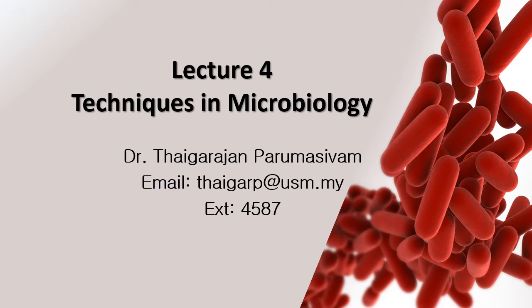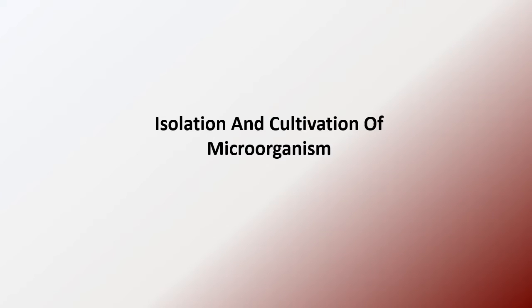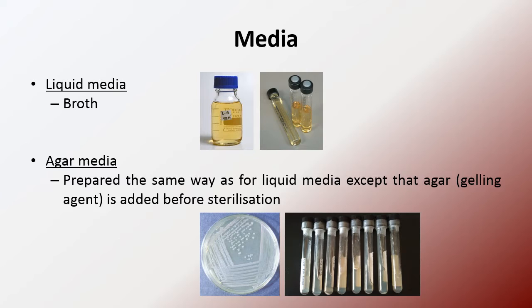Hi everyone, this is the second lecture on the techniques in microbiology. We will learn about isolation and cultivation of microorganisms, particularly the isolation and cultivation of bacteria. Media is a substance which is used by the bacteria to grow.